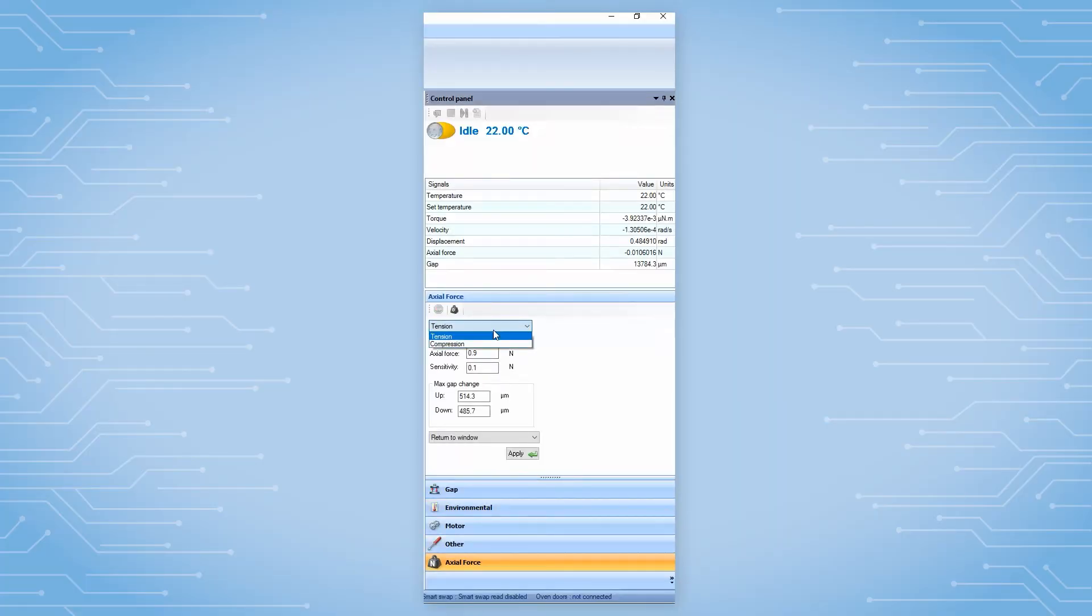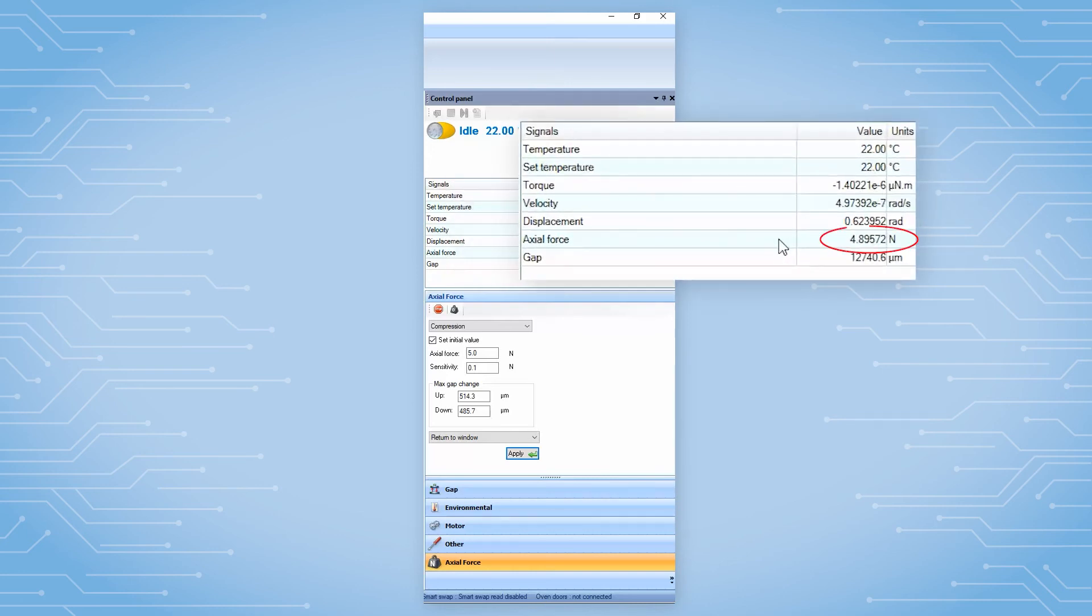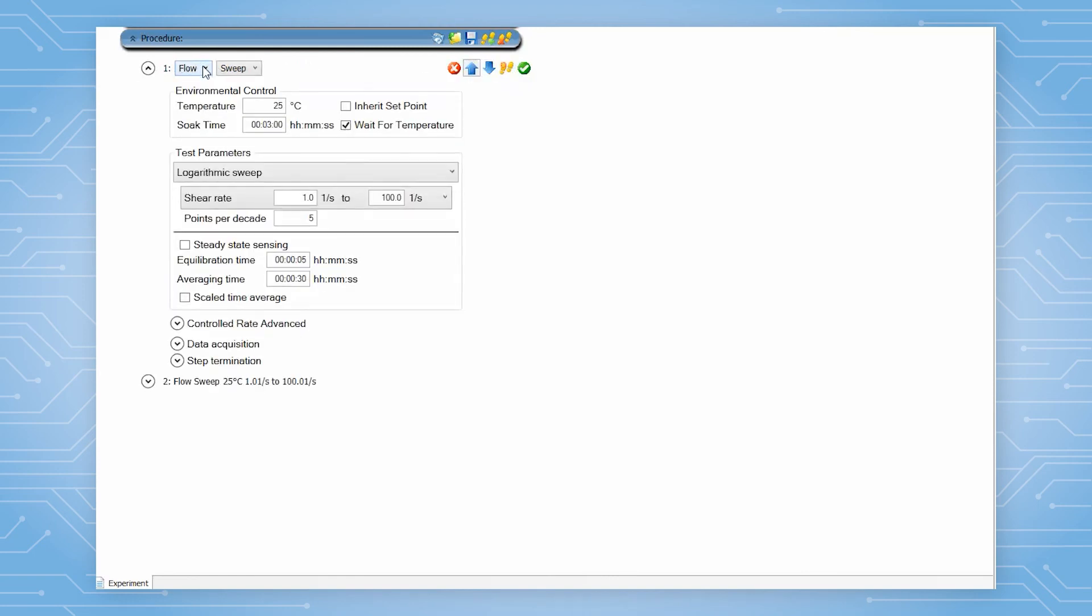Apply a constant axial force, either from the TRIO's control panel, or from the test procedure under the conditioning step.